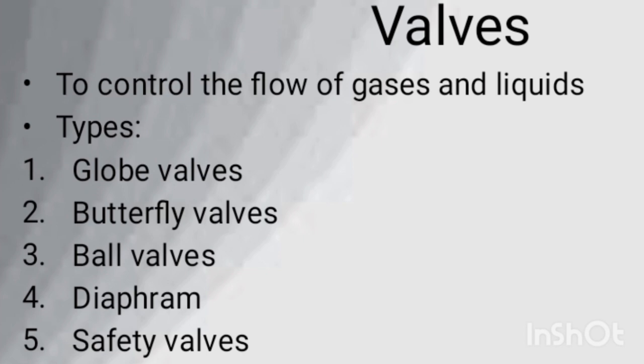Finally, we can discuss the functions of a fermenter. The fermenter does not cause any damage to the microorganism, and it should be easy to handle and clean, cost effective, and it should facilitate the incoming flow of the inoculum, media, etc. Less power requirement, and it is suitable for long-term operation, and it maintains aseptic condition and provides proper aeration and agitation. So, this is about the design of a fermenter.